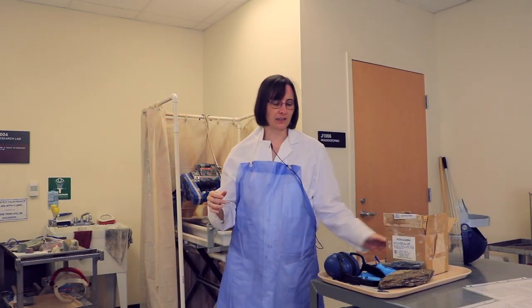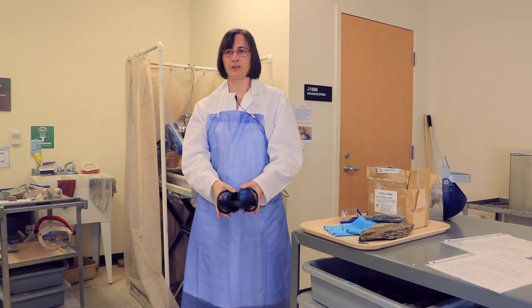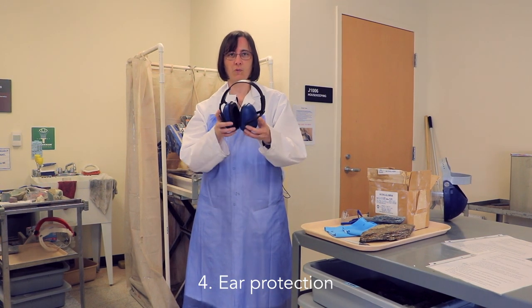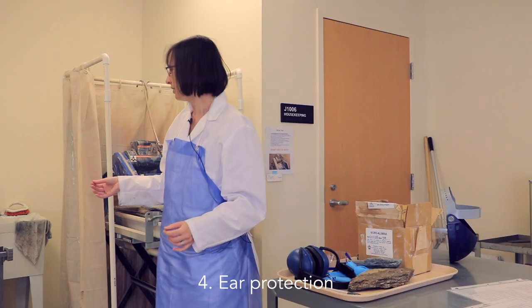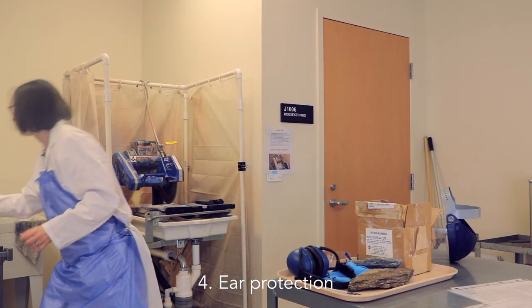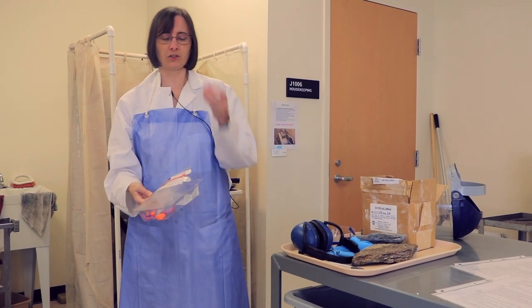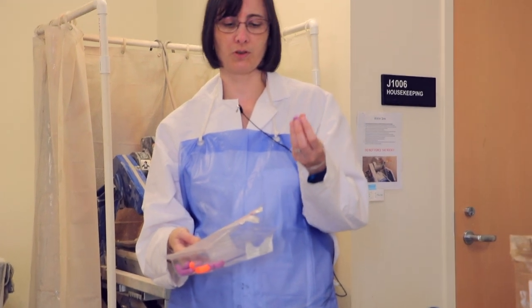The other thing that you'll need, especially with the rock saw, is some sort of ear protection. There are a couple of different types that are okay. One is these type of headphones like this. The other option is little ear plugs that you stick into your ears, and in this case you'd probably just keep them in the entire time you're using the rock saw.